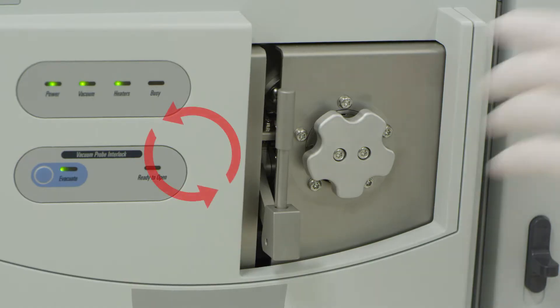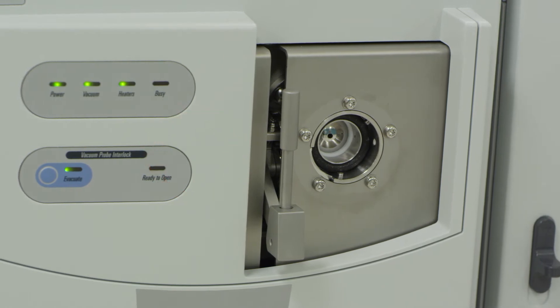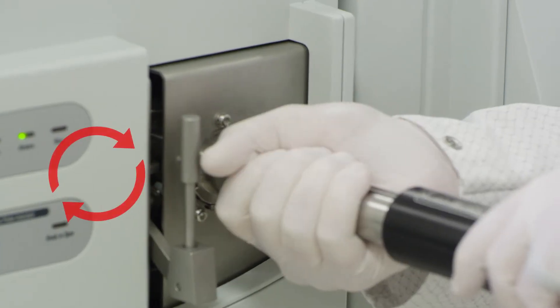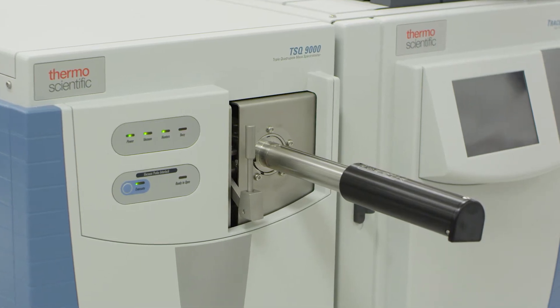On the manifold, turn the manifold cap to the left and remove the manifold cap. Insert the source installation tool and turn clockwise to lock the tool in place, but do not push the tool forward. Doing so will damage the instrument.